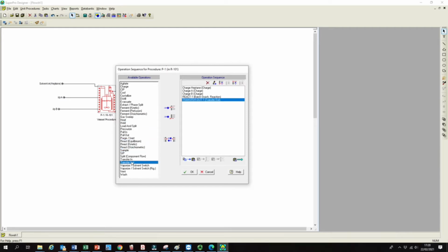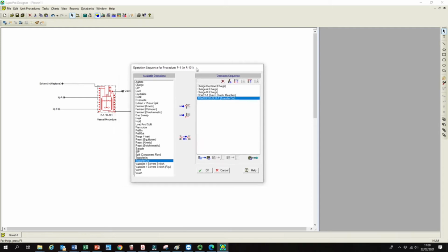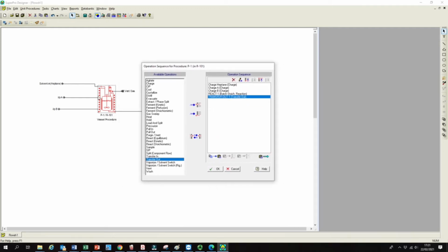So just double click. Instead of writing code and lots of programs, you have a nice graphical user interface that allows you to just drag and drop. In this case, you just need to double click. If you double click, you will get the next operation in the sequence. So just delete it. This is like you are telling the software what to do.